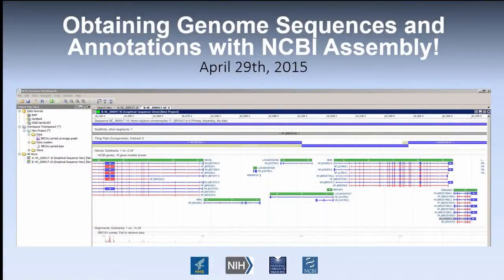Great. All right. So today I'm going to talk about obtaining genome sequences and annotations with NCBI Assembly. In my personal view, right now, Assembly is the fastest, easiest way to get genome sequences and annotations from NCBI, and I'll talk about why that is over the next few slides.